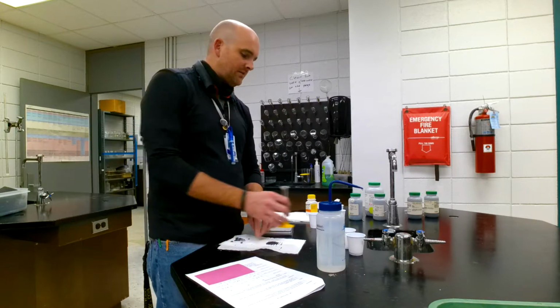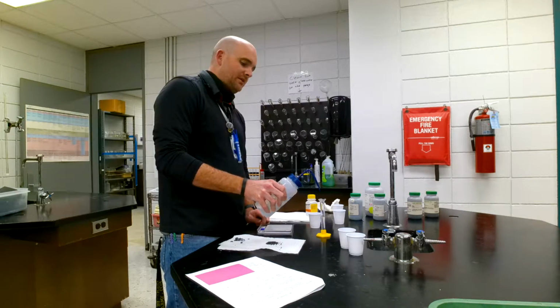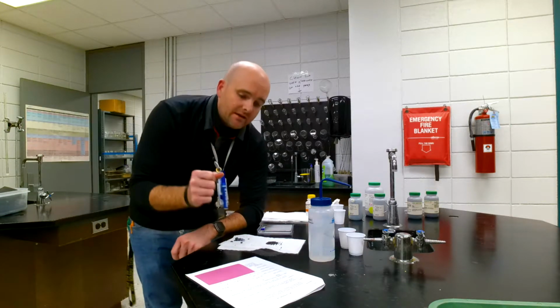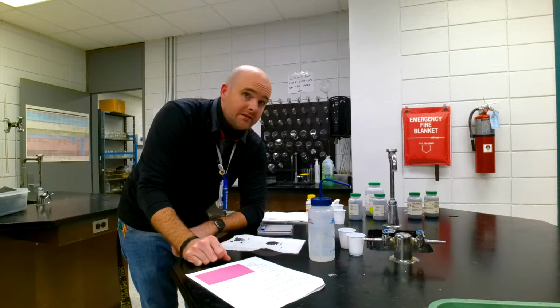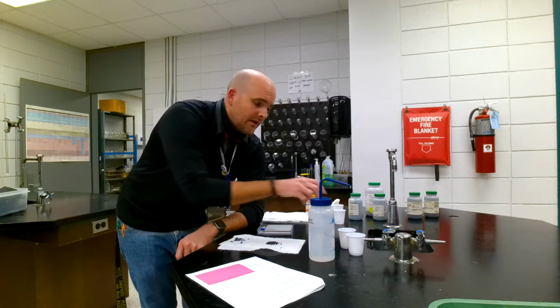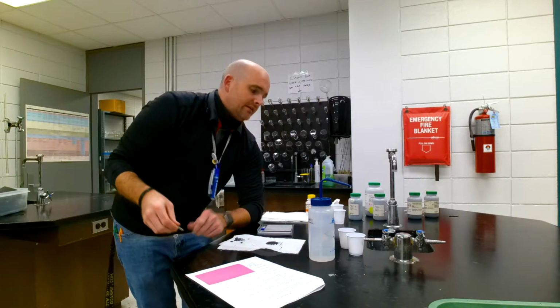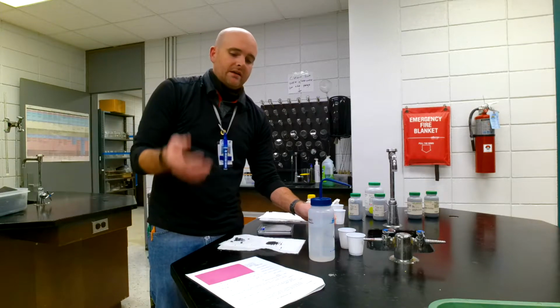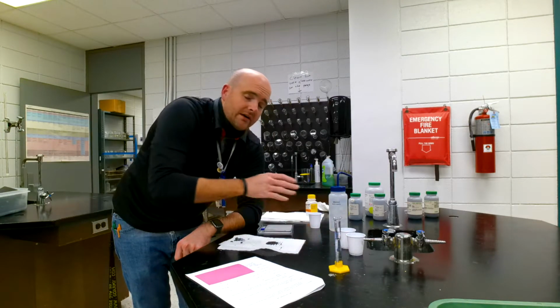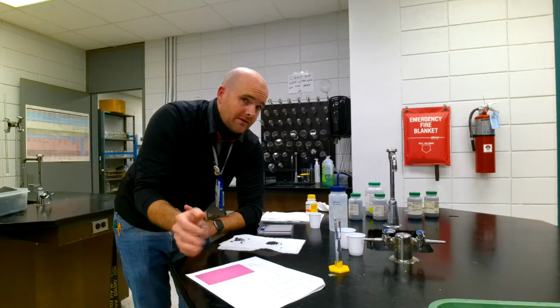I already found the mass, but what I should have done is I should have sprayed in the water, and then what you do is you write down the volume of the water alone. Now that is not the first blank that you see, that is not the second blank you see, but it is the third blank you see, the volume of the water alone. So that is simply this one. This is your initial volume. You take that reading, whatever it is, and then you put the metal in, ta-da, and then you find the volume of the water and the metal. Very simple. Once you've got that, that's all the data you have to collect.